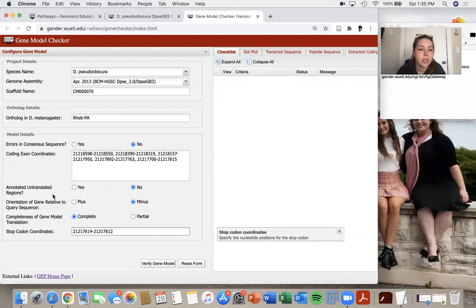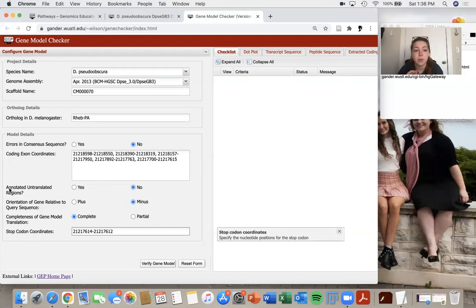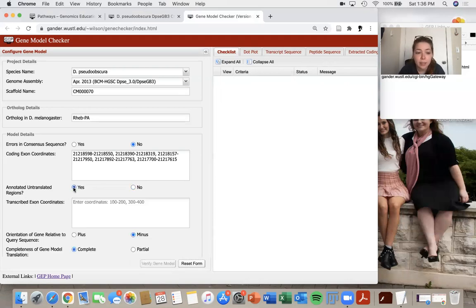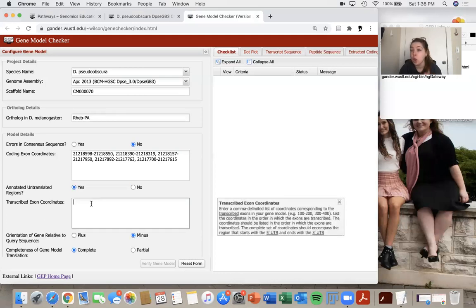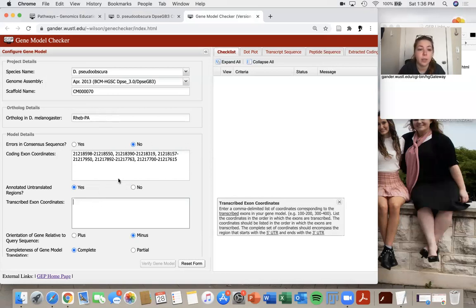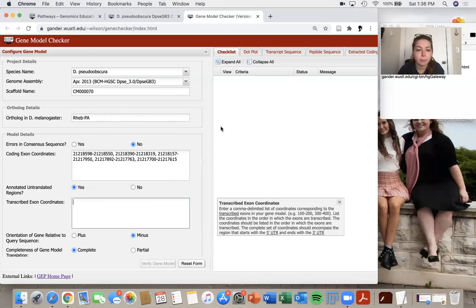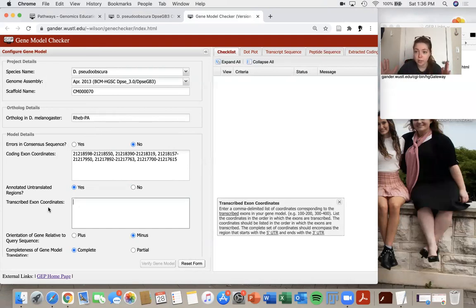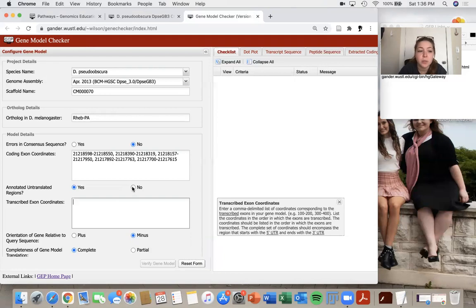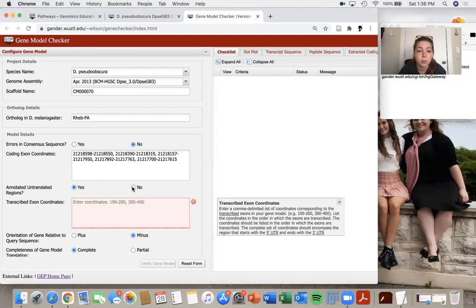So then going back to this annotated untranslated regions. So if you're only annotating the CDSs, you're going to select no and just simply leave your coding exon coordinates in there and no other issues. If you are annotating some untranslated regions, then you would select yes. And then in this box, you would type in all of your coordinates, which would be including the coding exon coordinates that you already filled out previously up here. For this gene that I'm showing today, we don't have any untranslated regions that I'm annotating. So I will select no.